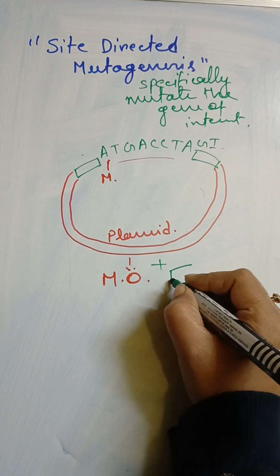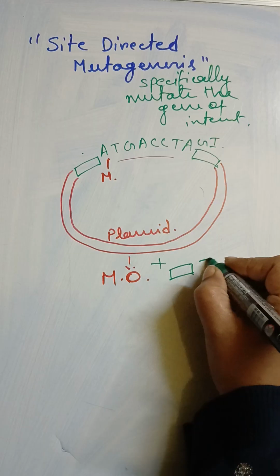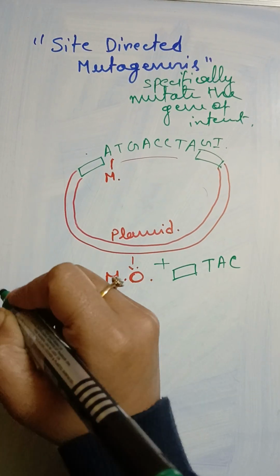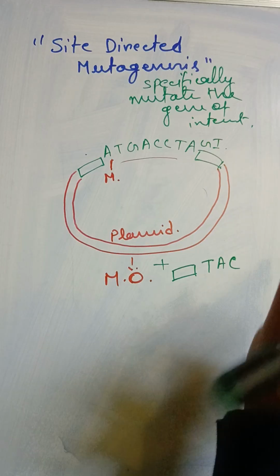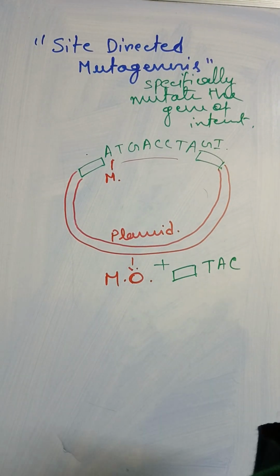How does the primer look? All the other things will be the same, but there will be a change in a single nucleotide base.